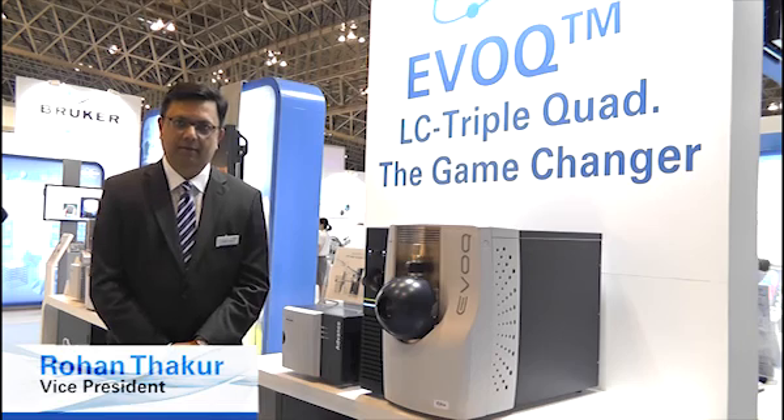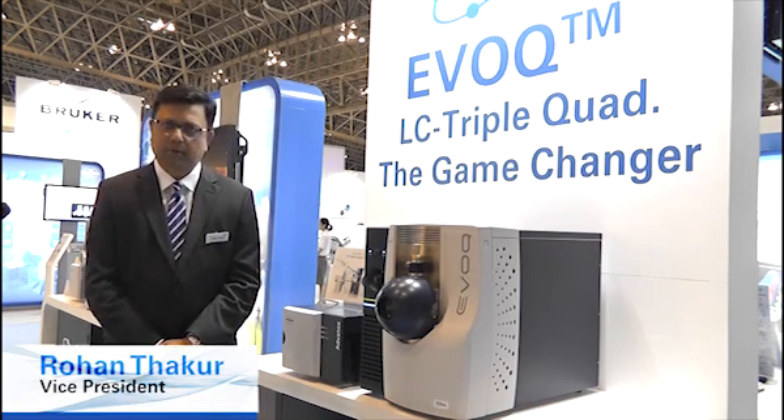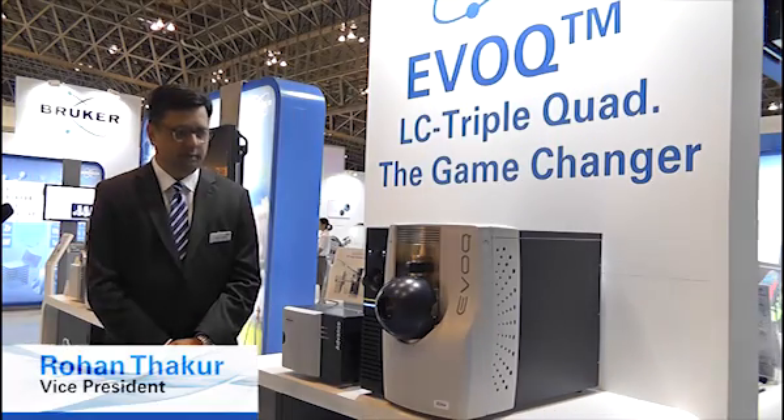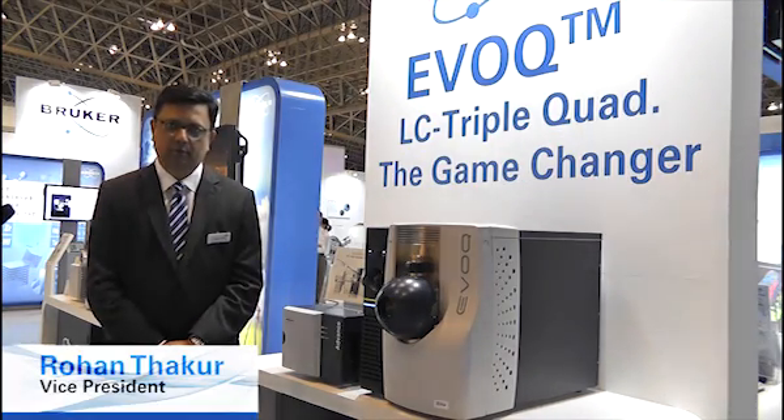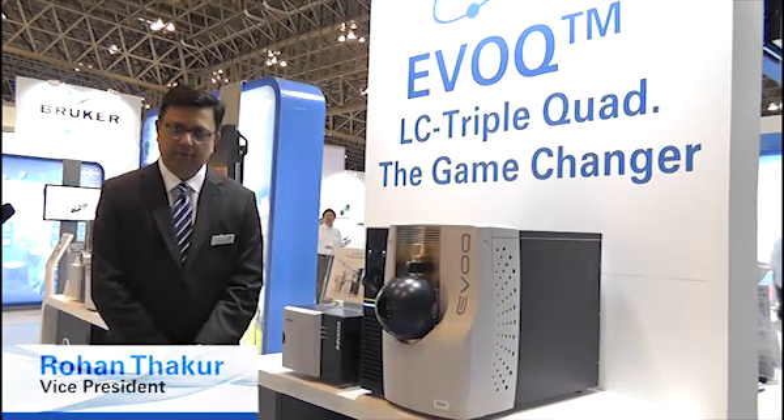Hello, I'm Rowan Thacker, Vice President Quad MS of the Brooker CAM group. It's my pleasure to introduce the Evoq LC triple stage quadrupole and the Advanced LC series of liquid chromatographs.